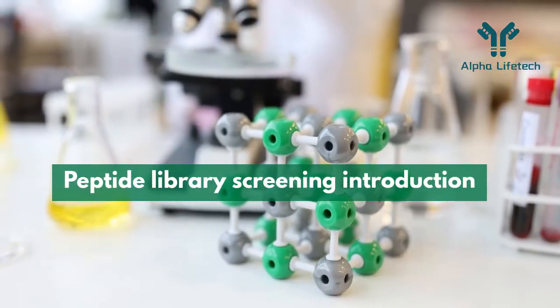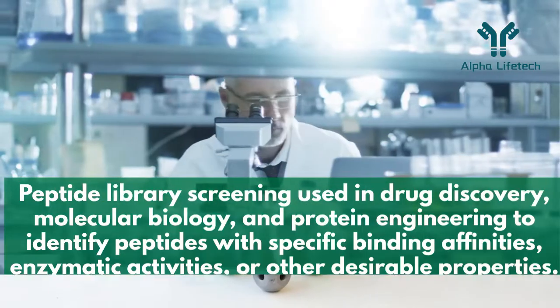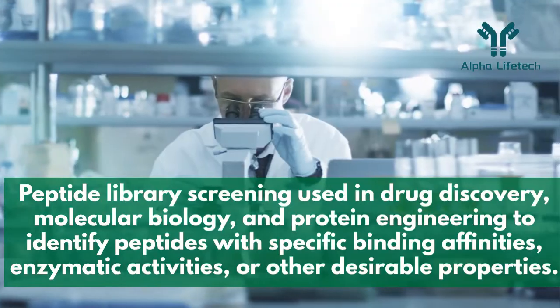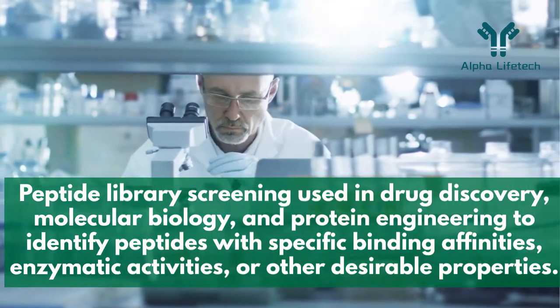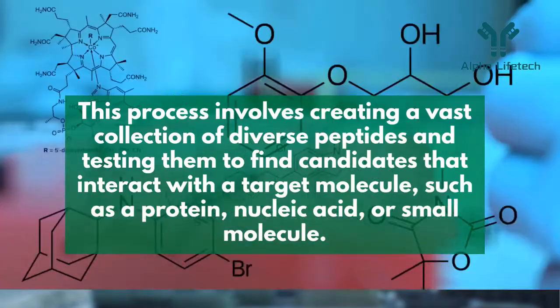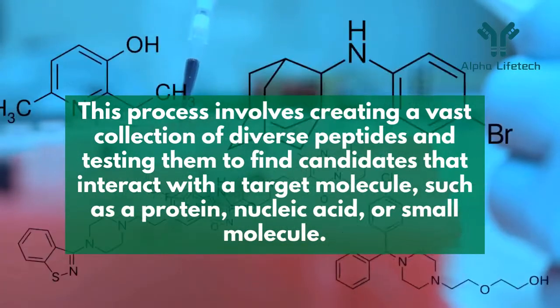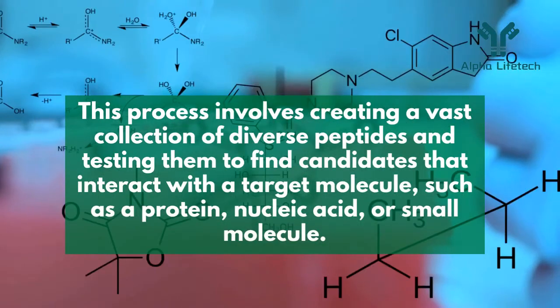Peptide library screening introduction. Peptide library screening is used in drug discovery, molecular biology, and protein engineering to identify peptides with specific binding affinities, enzymatic activities, or other desirable properties. This process involves creating a vast collection of diverse peptides and testing them to find candidates that interact with a target molecule, such as a protein, nucleic acid, or small molecule.